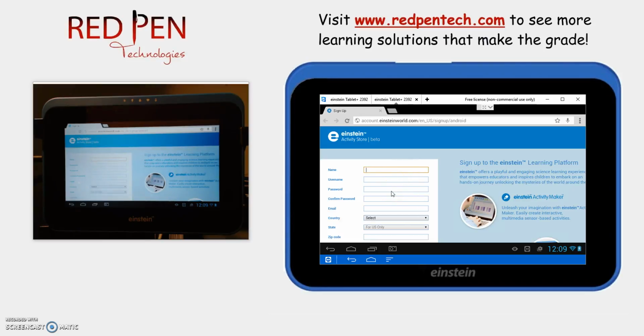We highly recommend when you use the username, if you're testing this out for a form of a pilot, that you use something generic that you feel comfortable sharing with students, because all of the students that utilize the application within your lab will use the same username to start.